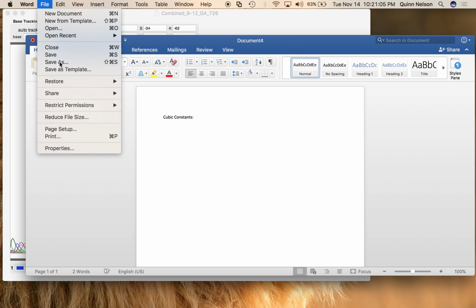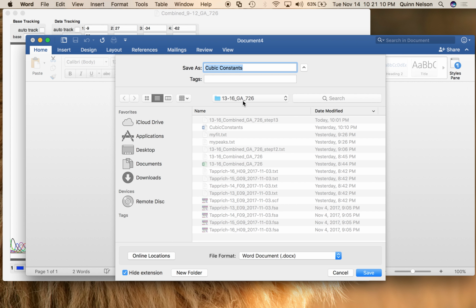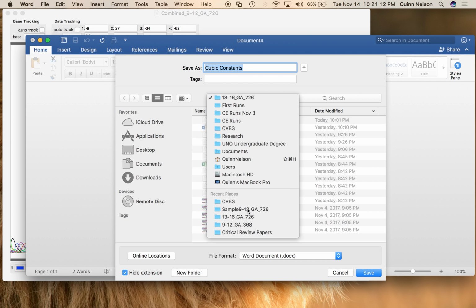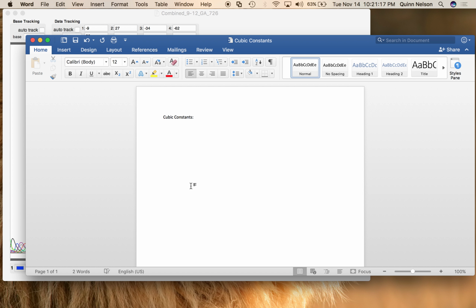And we're going to need to save this in the folder we've been working in. Okay? This is sample GA726. Save. Perfect. So the first alignment is going to be channel 3 to channel 1. So 3 to 1. You're going to have 4 numbers. Boom, boom, boom. Then we're going to do 5 to 1. Boom, boom, boom. And then 7 to 1. Okay. You'll fill this out as we go along. Command S. Save this. Pause here in Word.